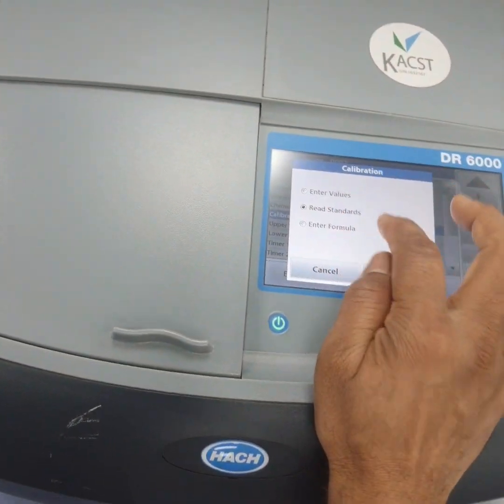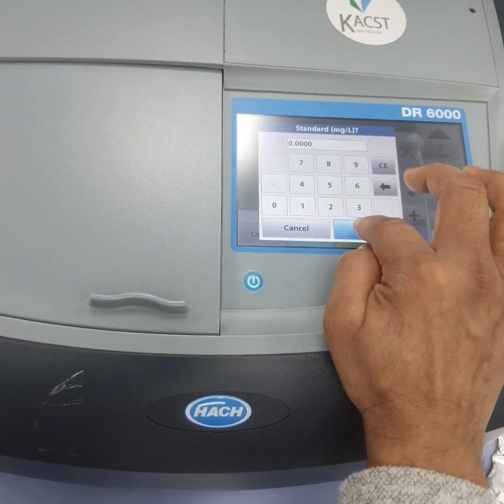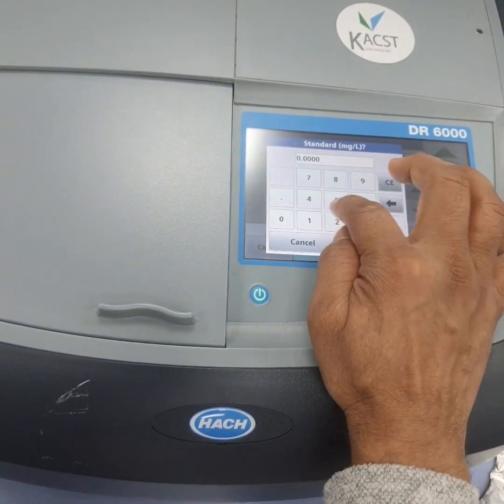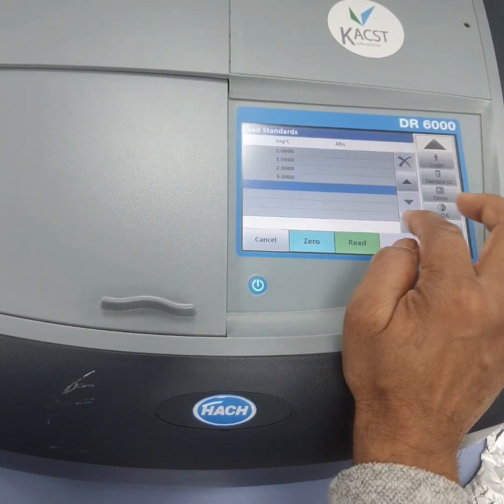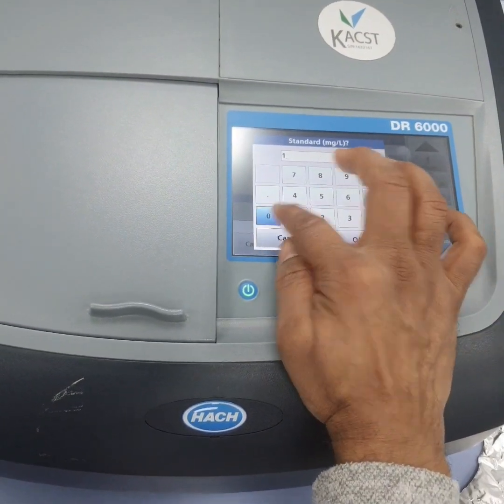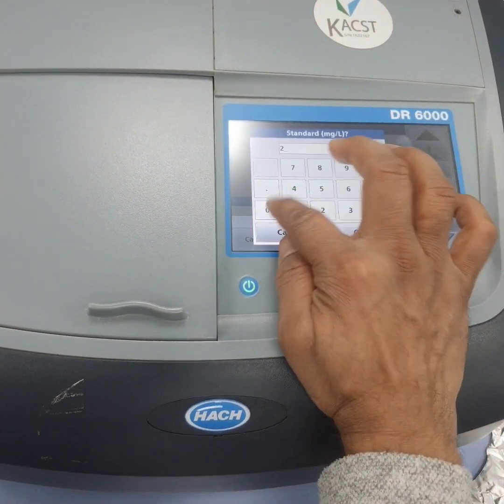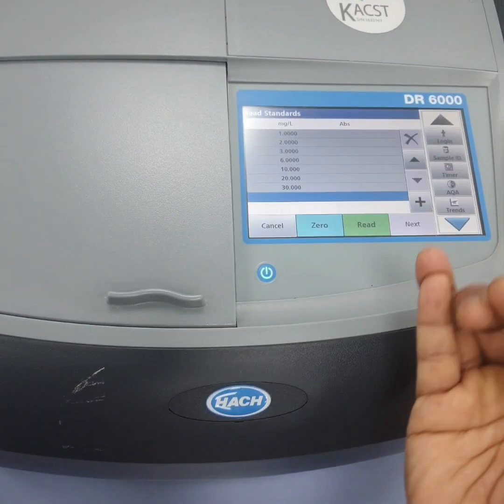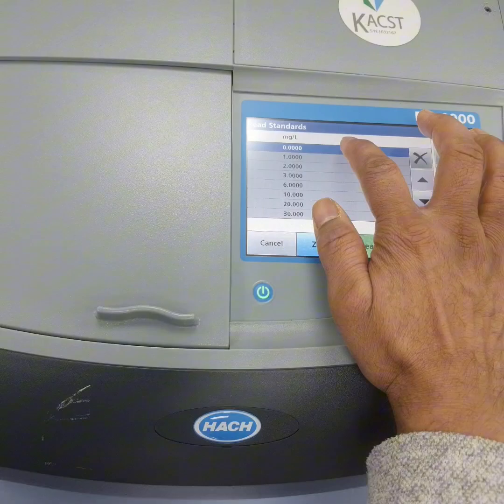So read standards. First of all you can put 0, then 1, then 2, then how much? 3, then 6, 10. Minimum, how many points for calibration? 3. Minimum is 3. Then 20 and 30. Let's try how much it can go, because there is a limit also. Read. So now we'll start first of all with 0.